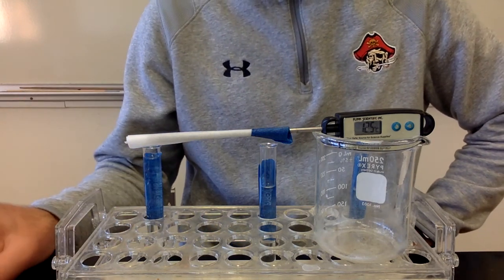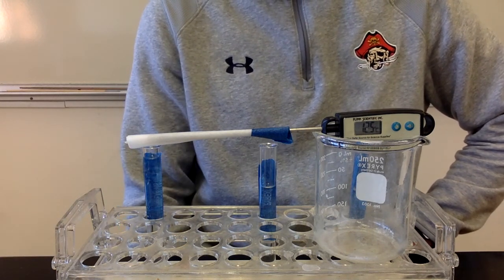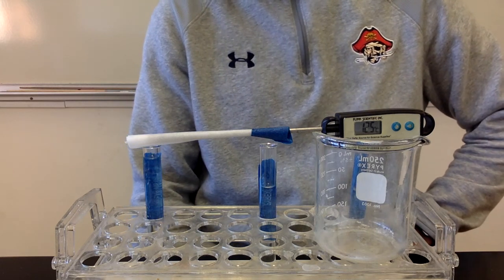So we'll do this for about 1 more minute, and then we'll stop and we'll switch to the other liquids, which are acetone and ethanol.